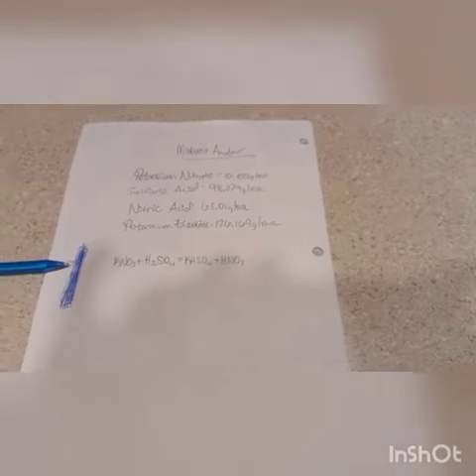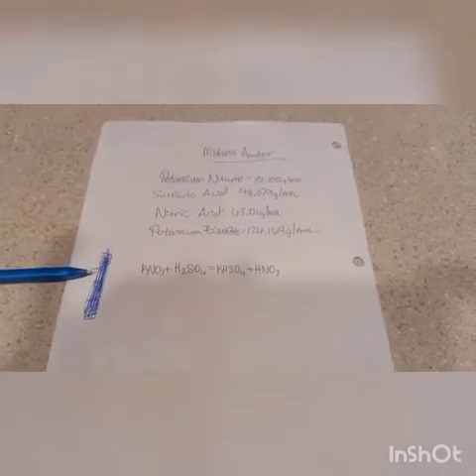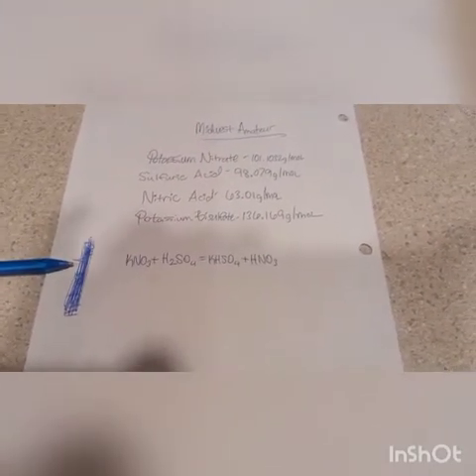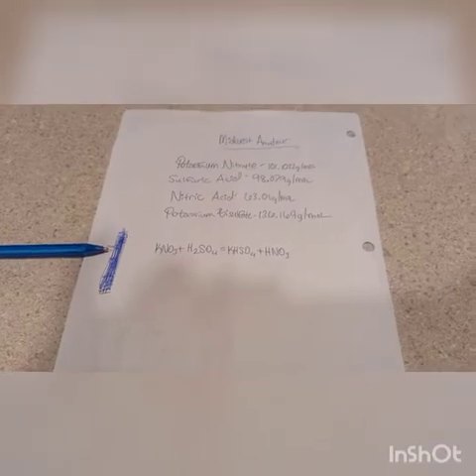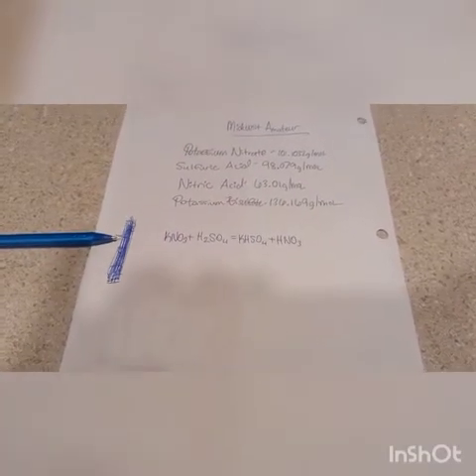So once you start the heating, everything starts to melt. You will notice the nitrogen dioxide, brownish red gas, gets really dark inside. So what I do is I have my vacuum takeoff adapter. I've hooked a tube that's hooked to a funnel, and I submerge the end of the funnel, not the tube part, but just the funnel, in a solution of sodium hydroxide. This will capture the vapors and neutralize them.